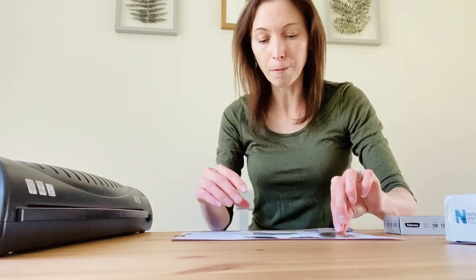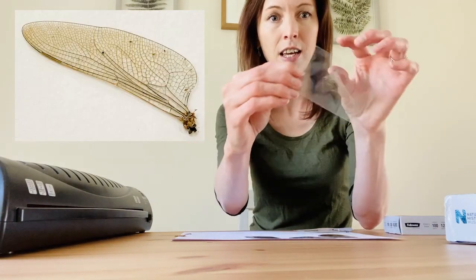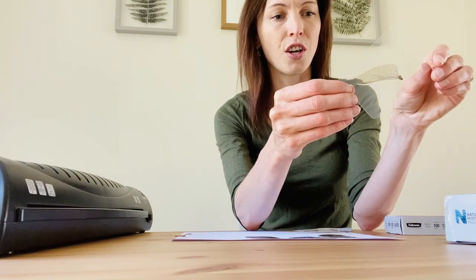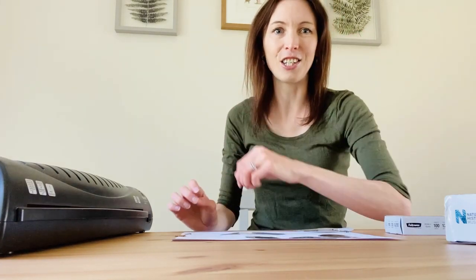I've also got a dragonfly wing here that I made a little while ago — a friend gave me this one, she found it in her garden. But I've also had dragonflies on the windscreen of my car, stuck in the windscreen wipers, so that's a little top tip of a place to check.